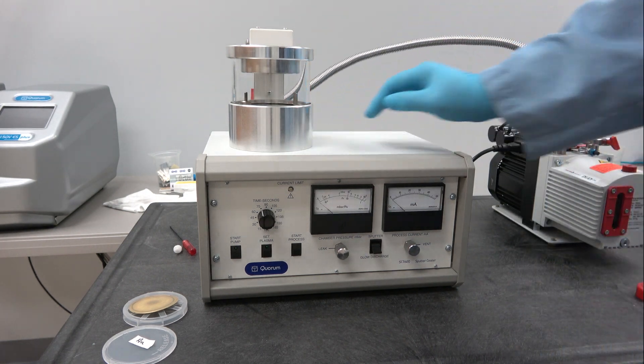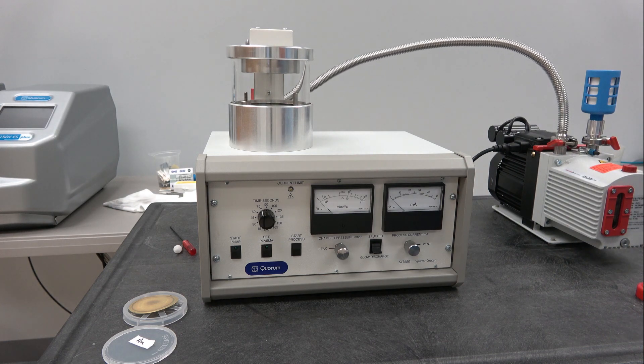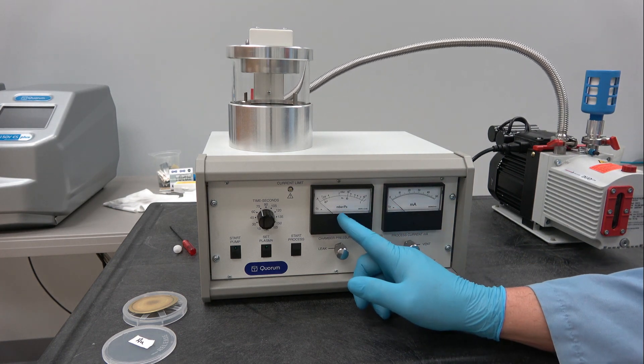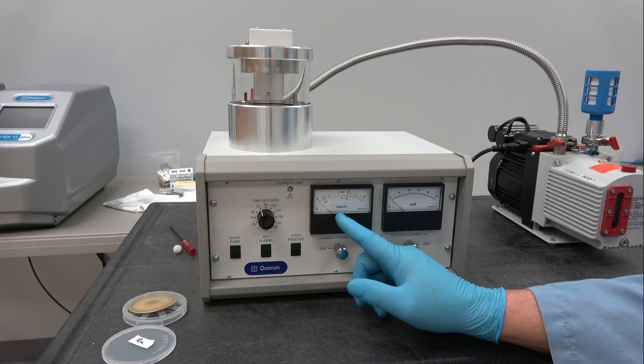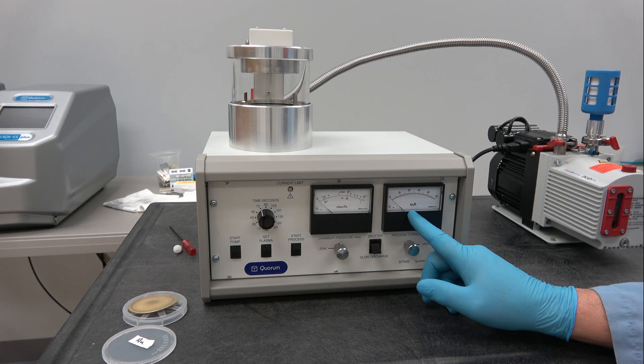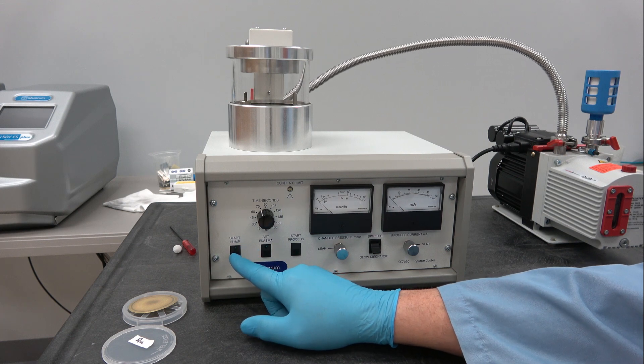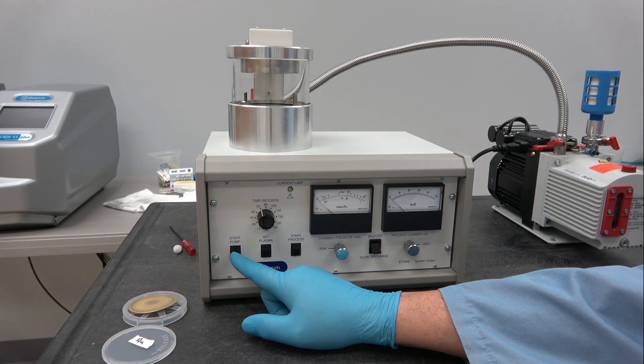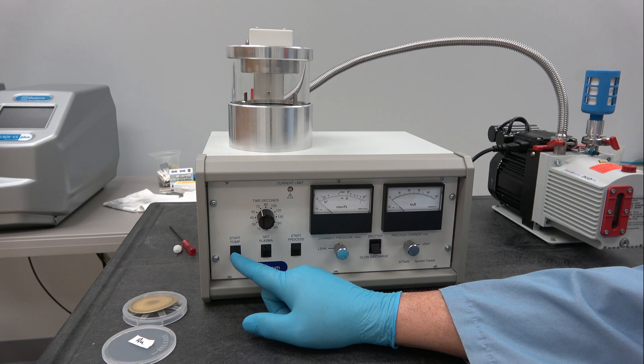We have the vacuum meter here. We have the sputter current analog gauge here. Start pump will start the whole operation, which I'll demonstrate in a moment.